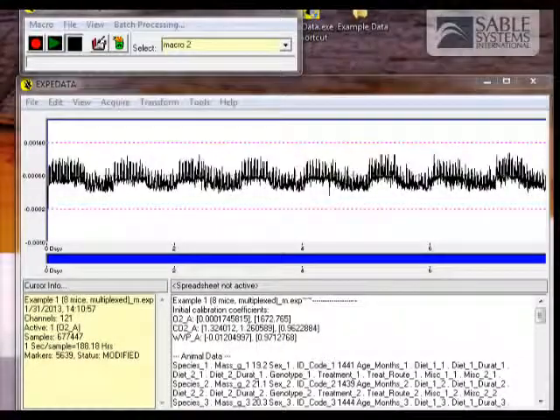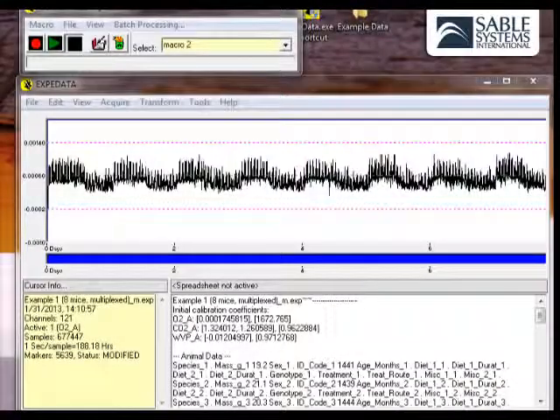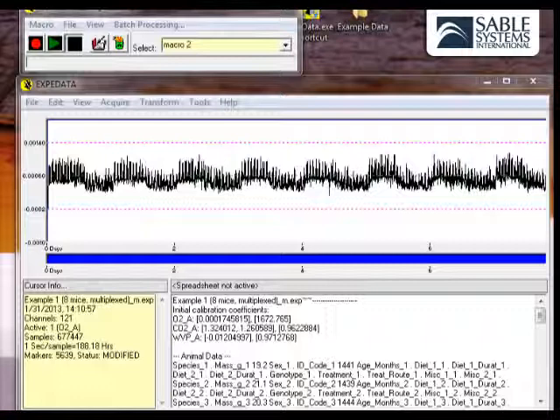To analyze the data that we have just transformed with Macro 1, we can either use the existing copy of that file in memory in Expedata, or we can take advantage of the fact that Macro 1 has automatically saved a modified version of the file with all of the processed and transformed data inside.